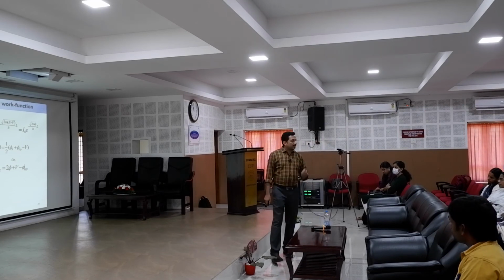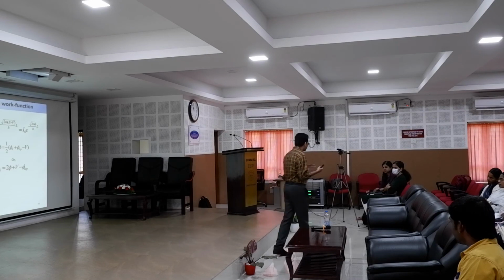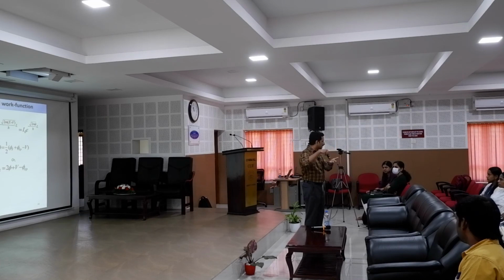You should be careful here. The work function of the material will be a local work function, because we are going to see only a few atoms. When you are doing XRD, X-ray diffraction, you know that you are getting many peaks because it is a multi-crystalline or polycrystalline material. Which means that if you measure the work function on one crystal, and you just move slightly away, the situation may be different there. You will get another work function corresponding to a different state or different crystallography. So you are not going to get an average work function. You are getting a local work function.